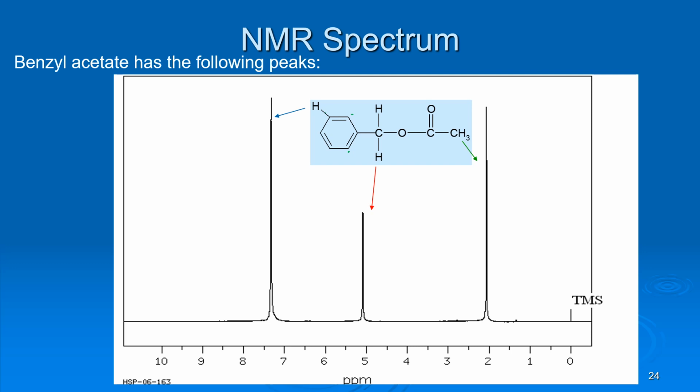And then the hydrogens attached to this carbon here on the green arrow are the furthest to the right because they're sp3 hybridized. They're not quite as far; if it wasn't for the C double bond O, they might be even closer to 1, but they're around 2 because they're near the C double bond O. So that's one example, and we'll be looking at some other examples.